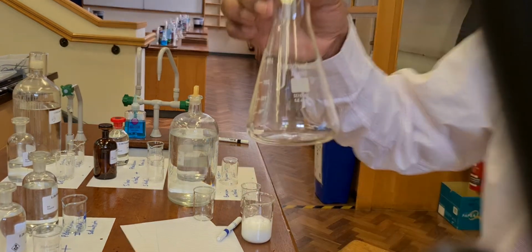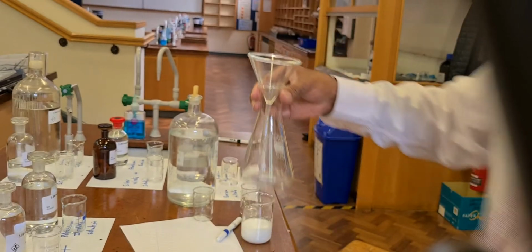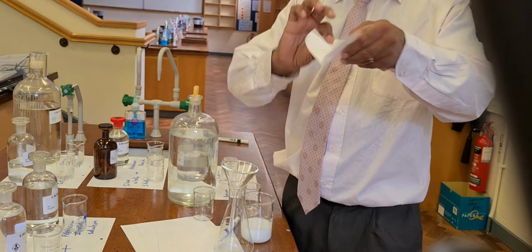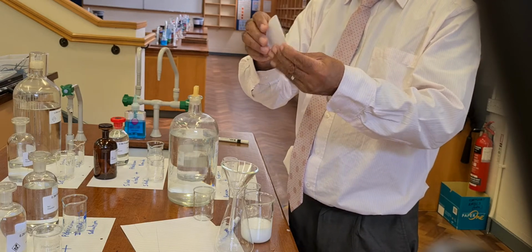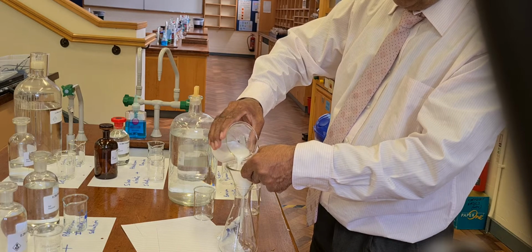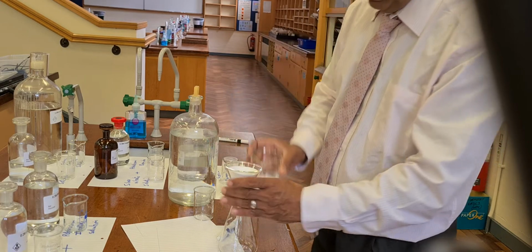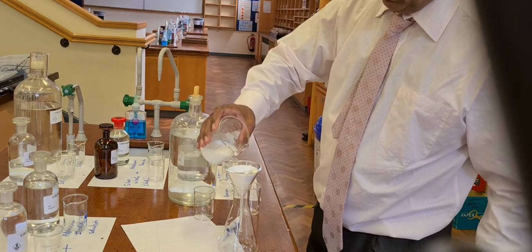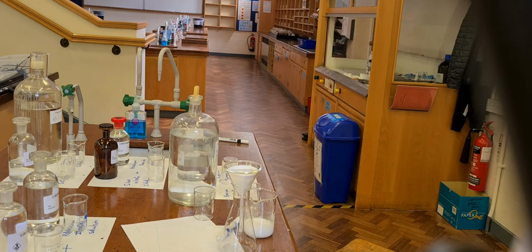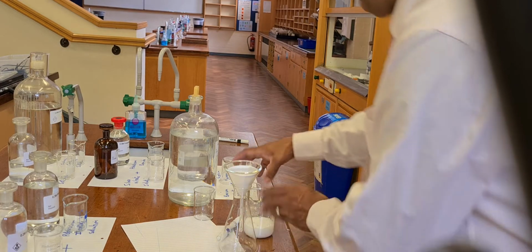Now if I get a funnel, get some filter paper, fold it in half and half again, put that in there and filter. I hope you can see that.